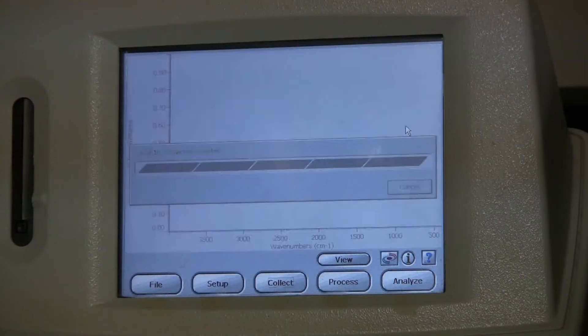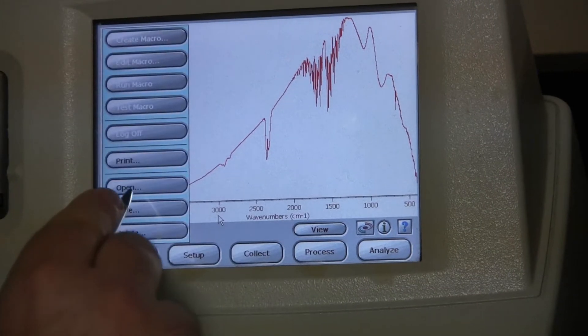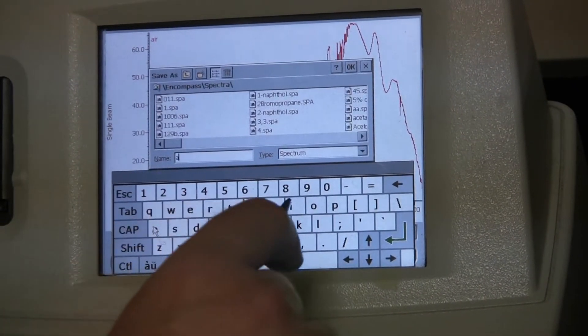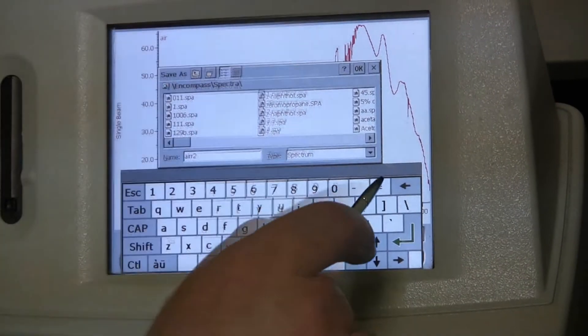When finished scanning, it should look something like this. Now go to File, Save, type a name, and then click OK.